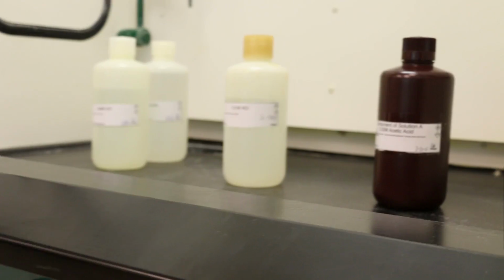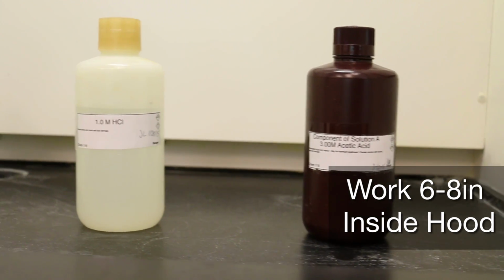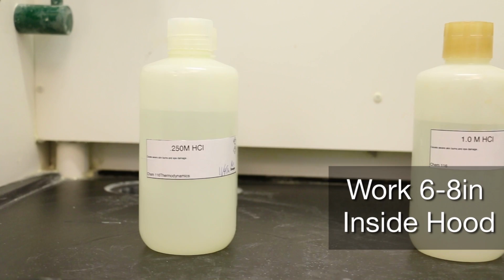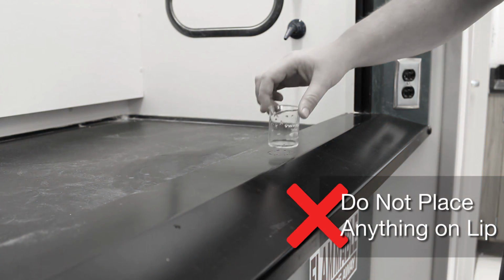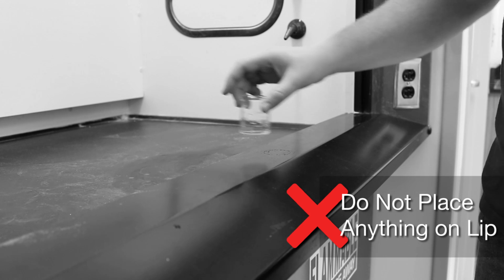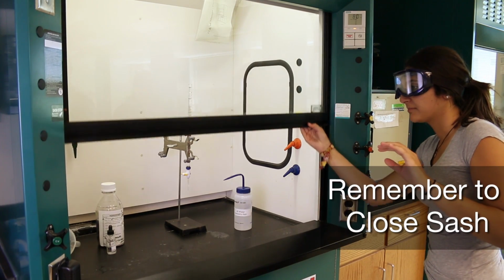Some experiments will have you perform an experiment in the fume hood. Work 6 to 8 inches from the edge of the hood. This is where the ventilation is best for vapors being produced in the hood to be drawn into the ventilation. Also notice the edge of the hood has a lip. Do not place beakers or other containers on this edge. Containers can spill or break when they are placed on this edge. The sash should be closed when the hoods are not in use.